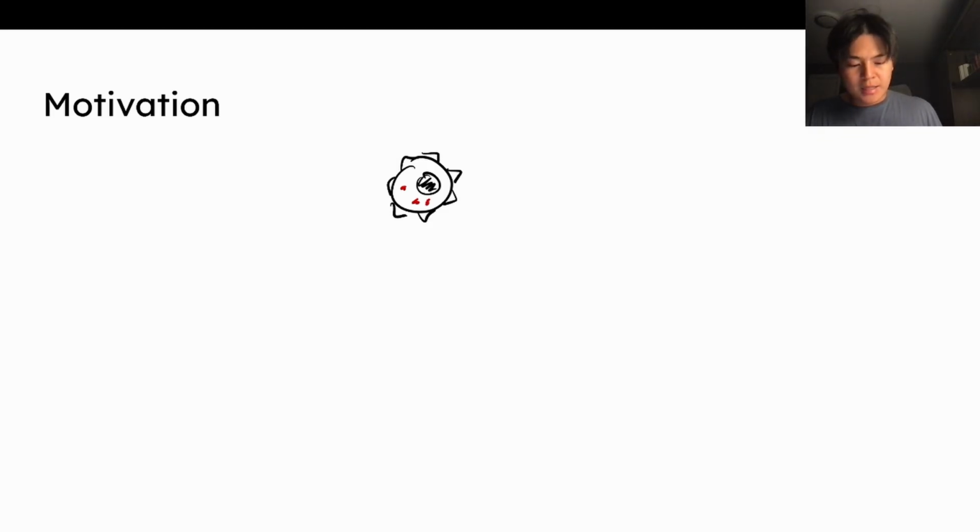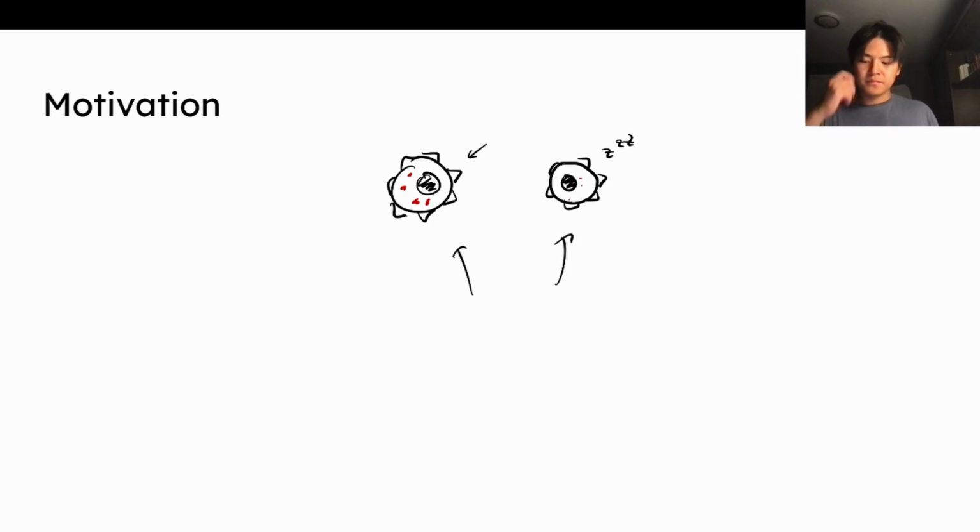And let's say we want to figure out how many granzymes are in one of the natural killer cells and another cell. Let's say an inactive natural killer T cell, for the purposes of studying immunology. This guy's sleeping, and he'll probably have less granzymes, maybe not nearly as many. And we want to determine the relative abundance of these two granzymes. So how can we do that?